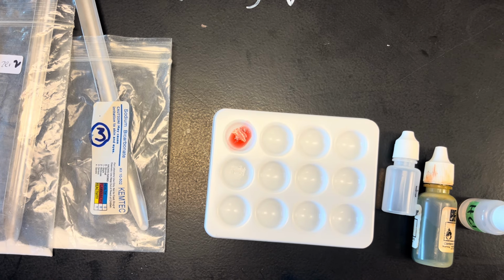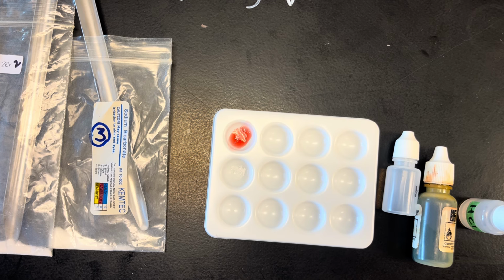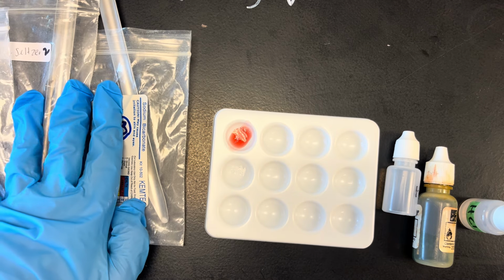So you're going to record your observations. Ideally, you'd have slightly different observations for each of the 5 powders, and then that's going to help you to identify the unknowns tomorrow, because you're going to compare what you got today with what you got tomorrow. Tomorrow you won't have these substances accessible to you. You'll only have the unknowns, so you will have to rely on your observations.